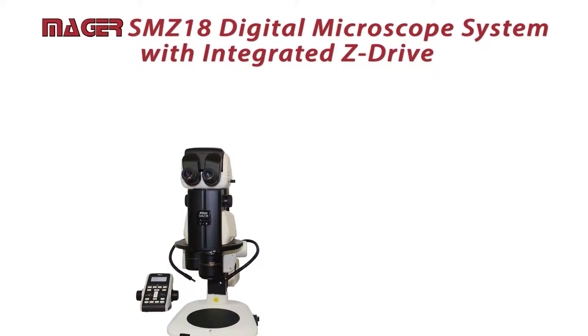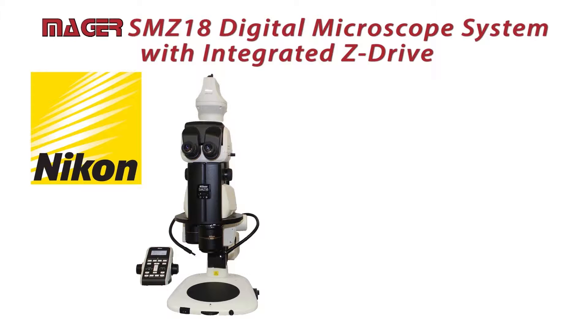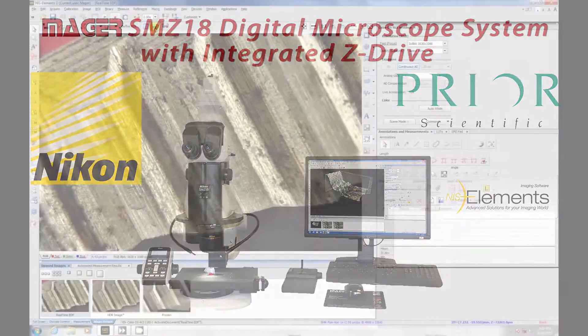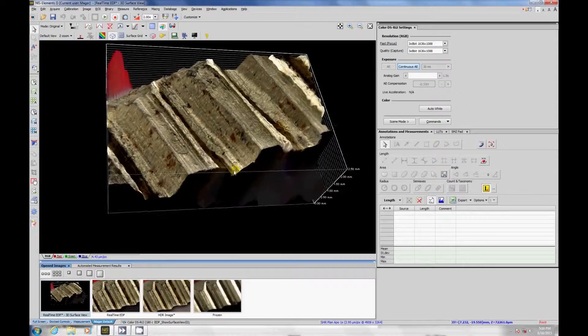In order to configure the SMZ-18 as a digital microscope, we will be adding a Nikon DSRi-2 16 megapixel color camera, a Prior motorized XY stage which has 4 inch by 3 inch travel for image stitching, and Nikon Elements software — a powerful yet user-friendly software environment that will integrate the entire system.